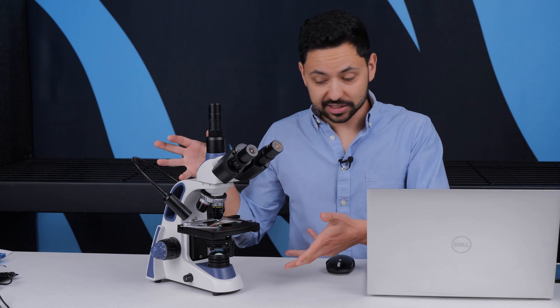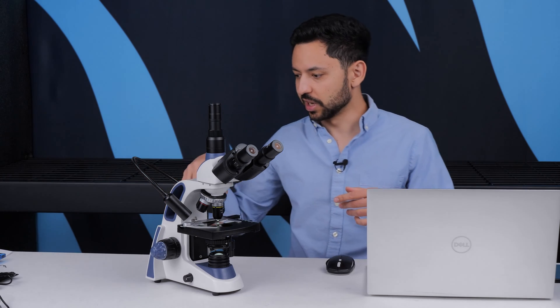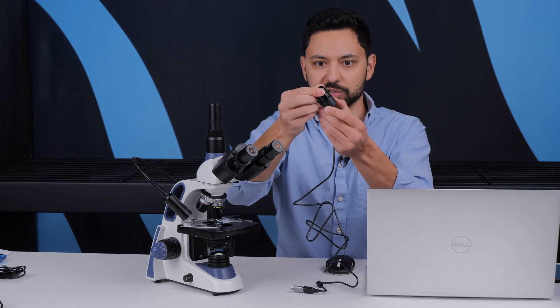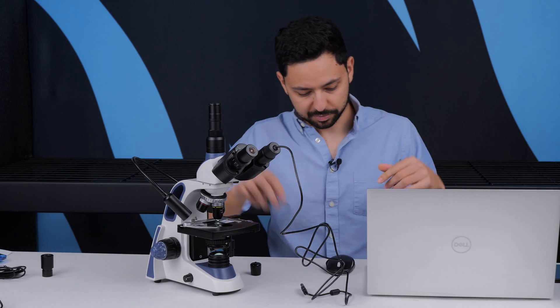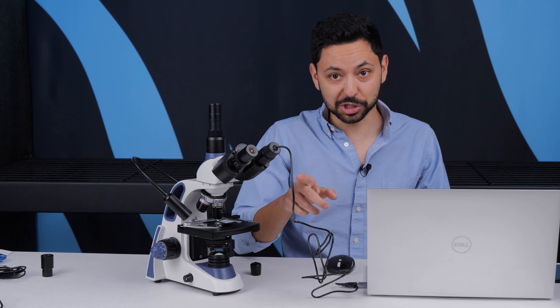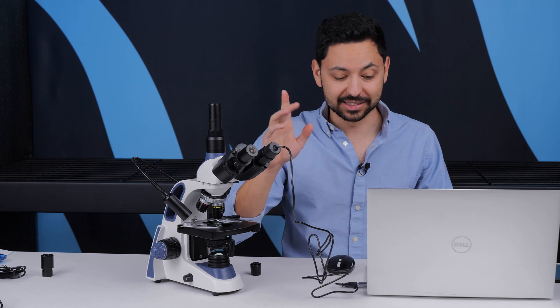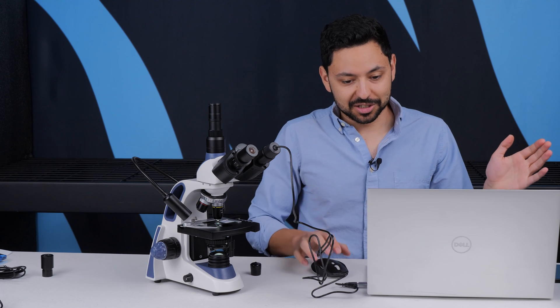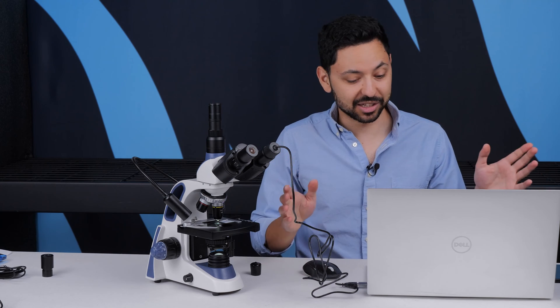This is our Horizons microscope — it has a reflected light illuminator and is a trinocular capable microscope. The next thing we're going to try is one of these USB eyepiece adapters. This goes in place of your typical eyepiece, slots in nicely, and you hook it up to your computer. There are a bunch of these on the market, and unfortunately even if they look exactly the same they can function entirely differently. The microscope camera market is fraught with confusing marketing and product specs that don't really mean a whole lot.